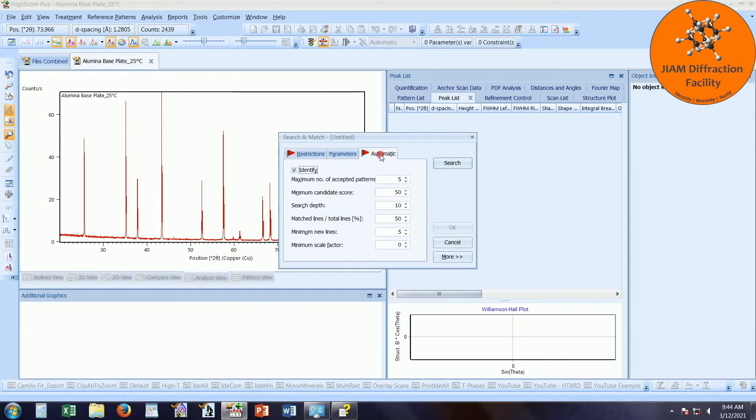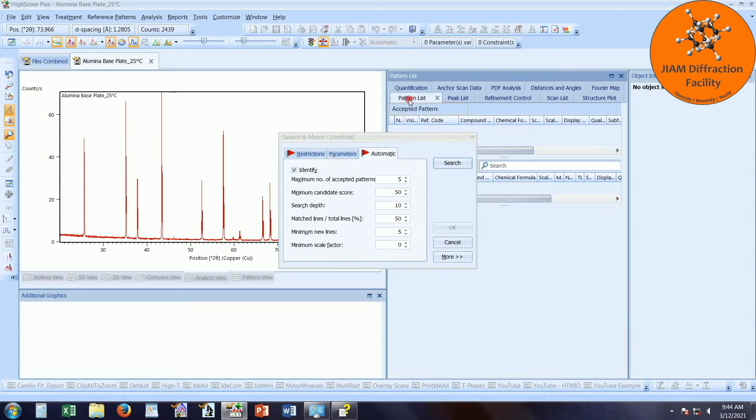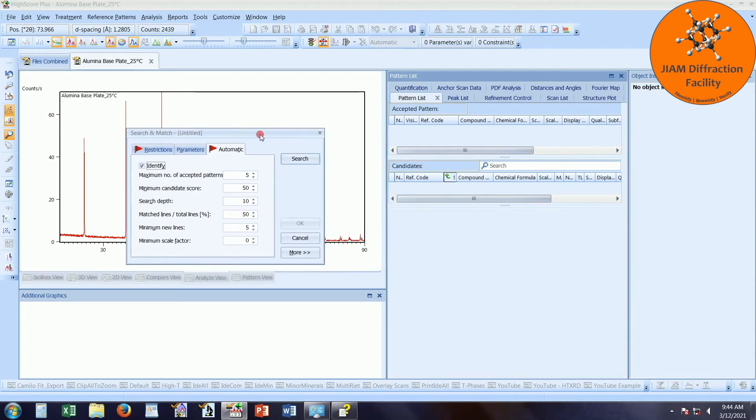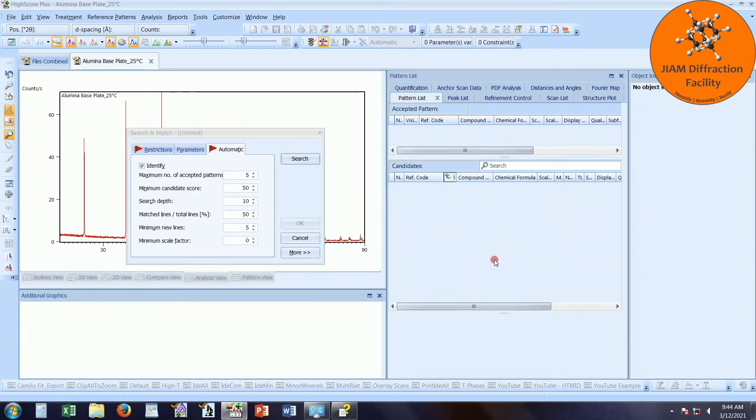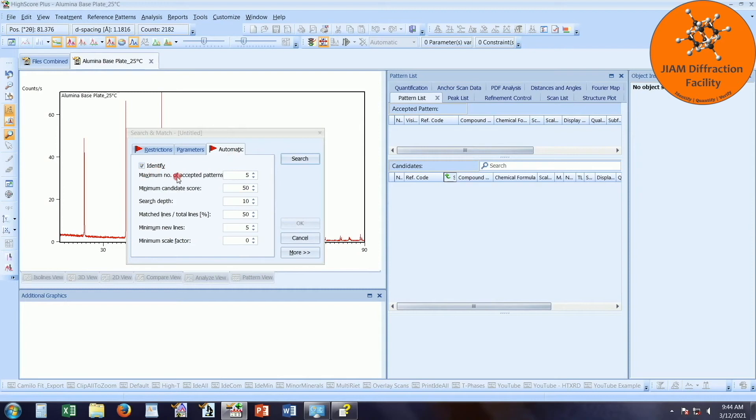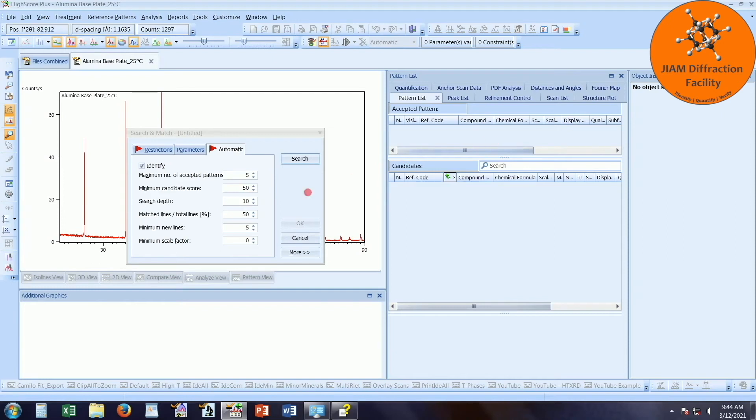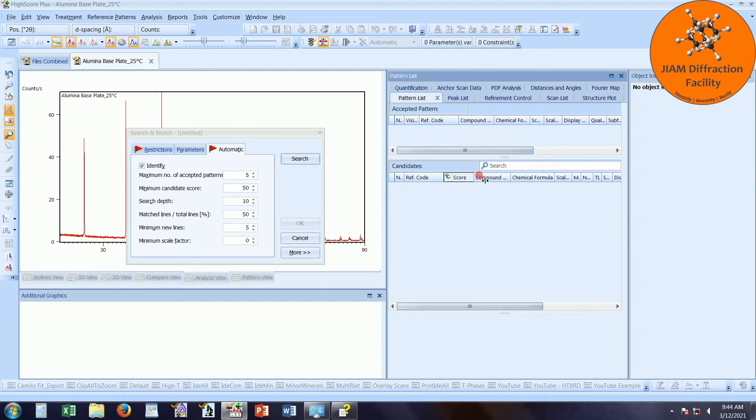I can come over here to automatic. And these are the parameters that determine which candidate reference patterns will be accepted. So if we look here, once we do our search, all of our candidates will be put here. And then anything that we accept will be displayed here. So this first line, maximum number of accepted patterns, I have set as five. Once we reach five accepted patterns, it will stop searching and identifying new patterns. The minimum candidate score that each candidate pattern must have in order to become accepted is 50. And remember, we have the score column.